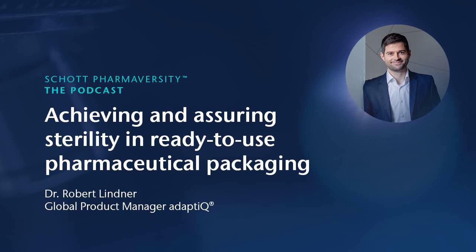During transport, you need to assure that the roads are not too bumpy, so that the containers are not shaken around, for example, to reduce the risk of mechanical damage. Of course, we do transport studies with our primary packaging containers within the secondary packaging. So we do standardized tests with these, but in very extreme cases, this could potentially deviate from reality.